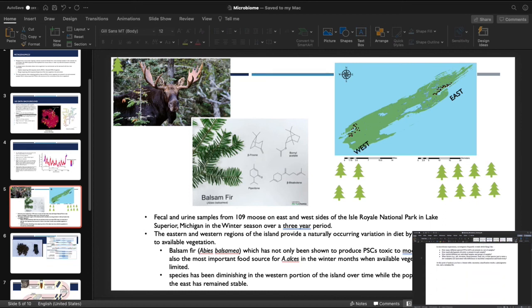So once you download all those files, then you'll have a feature table, which is a list of all the different types of species in your samples, taxonomy classification results, so who are they, a phylogenetic tree, and a metadata file.